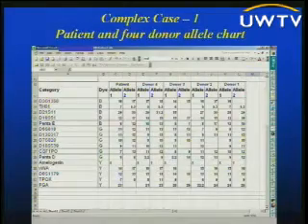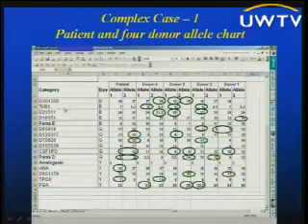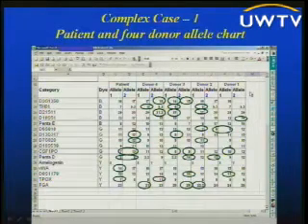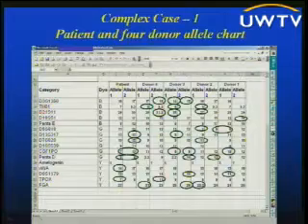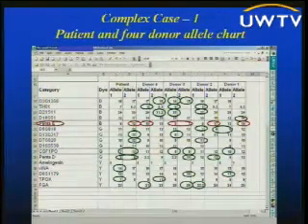So if you're only looking for uniqueness at all, there's plenty that's unique. And so there's all these loci that would show up. Unfortunately, if you look at all of these circles, you can see that none of them extend across all 5 individuals. If you wanted that, there's only a single locus that one could have used.